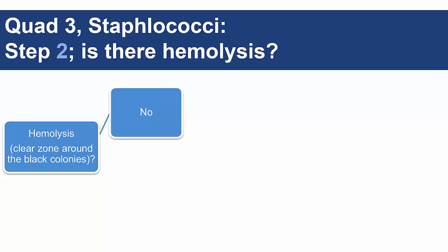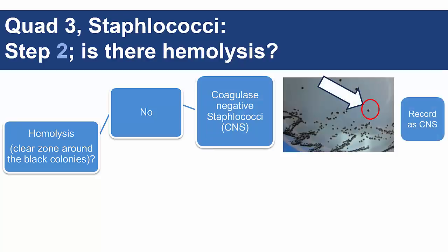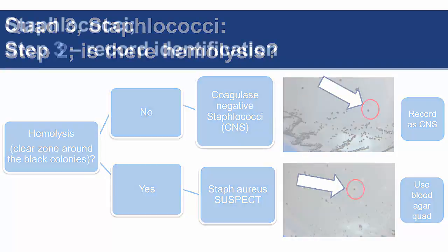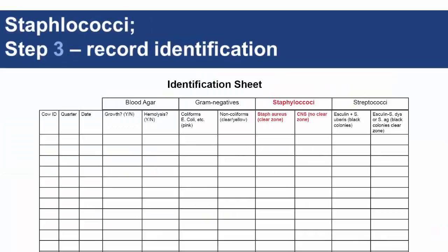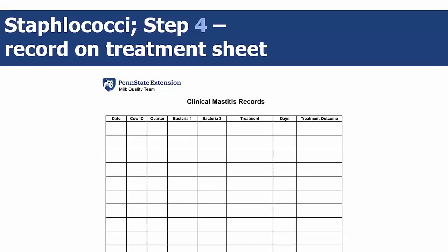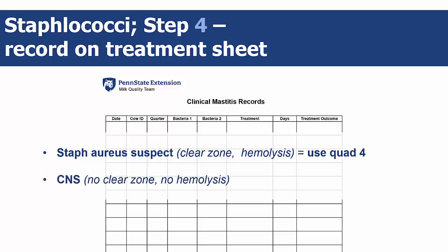Black colonies with no hemolysis are coagulase-negative staphylococci, or CNS. Black colonies with hemolysis are staph aureus suspect colonies. Step 3 is to record on the identification sheet whether the colonies are CNS or staph aureus suspect. For step 4, if staph aureus suspect colonies are present, you'll have to use the blood agar quad to determine bacterial species. Otherwise, record on the treatment sheet as CNS.